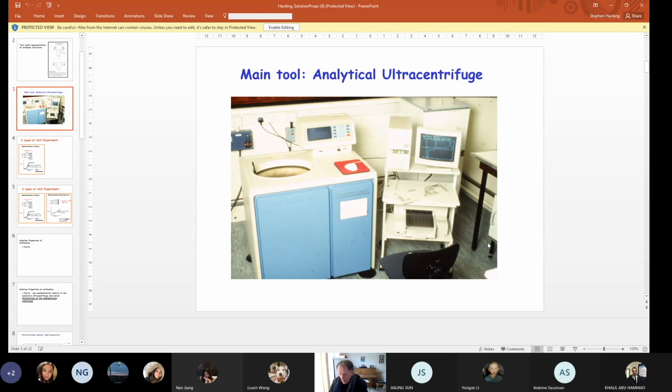Yeah, but as Khalil said, many of you have met small centrifuges where you're spinning materials to clarify a preparation from cell debris and this sort of thing. So many of you might have met bench type centrifuges before, but maybe not this type of instrumentation, which has an optical system.